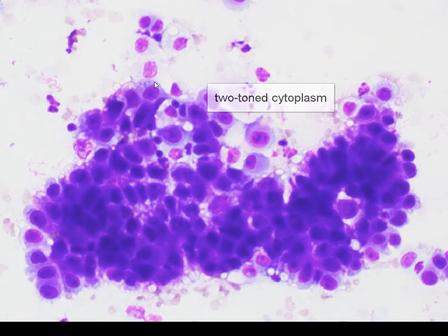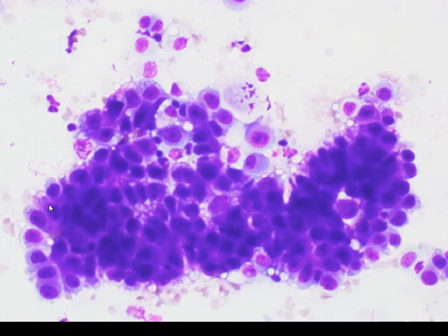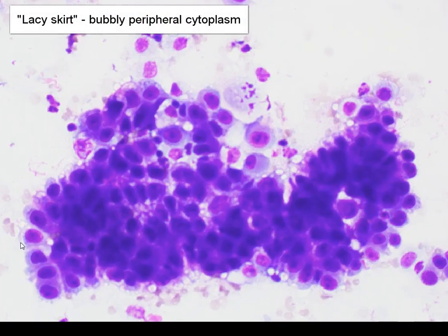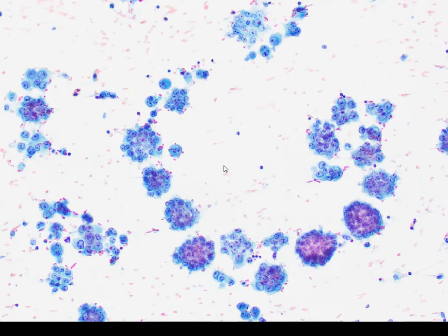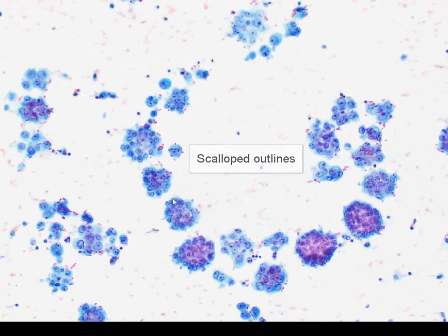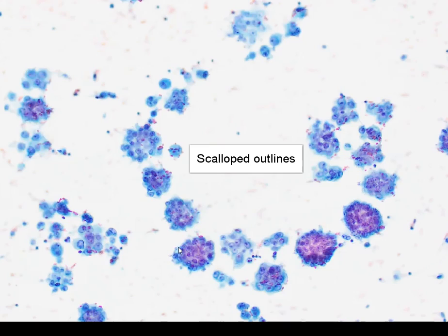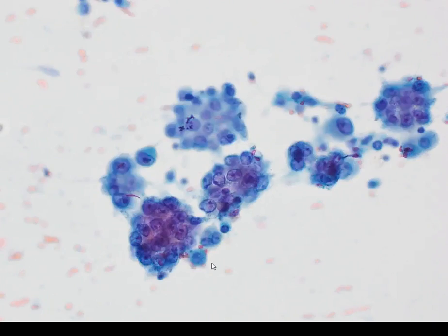And in some of the cells, we can see a little bit of bubbliness around the periphery of the cytoplasm, almost like a lacy skirt. Moving on to the alcohol-fixed smears, we can see again these relatively small clusters of cells, abundantly cellular, and we can appreciate the scalloped outlines of many of these crowded three-dimensional clusters of cells.